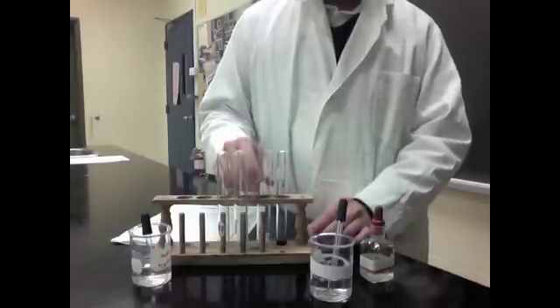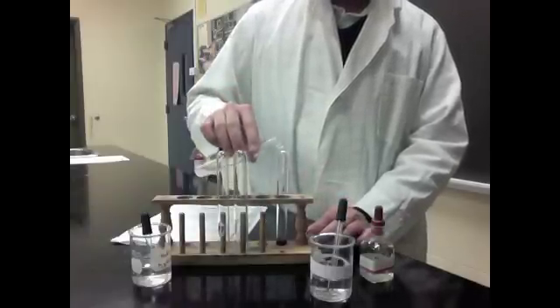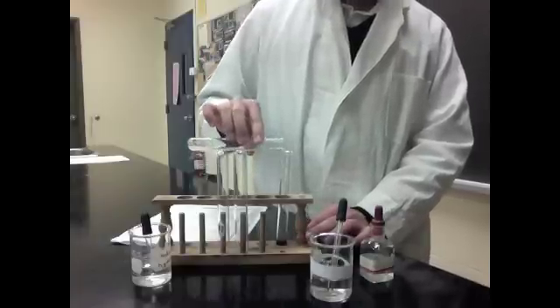Next, you will have to pour one of them into the other and record the results into your lab report.